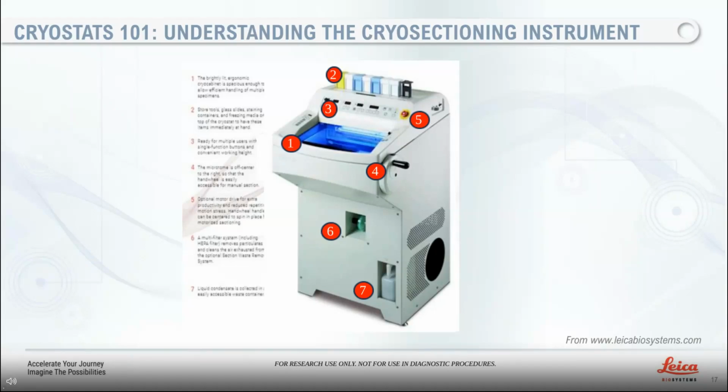In comparison, on an automated cryostat, the user selects the parameters and collects sections, but the cryostat oversees cutting your specimen. Reproducibility and accuracy are key for accurate quantitative and qualitative results under the microscope.